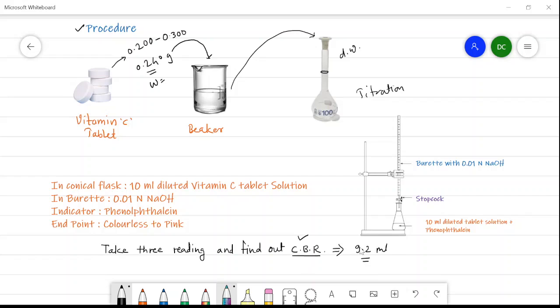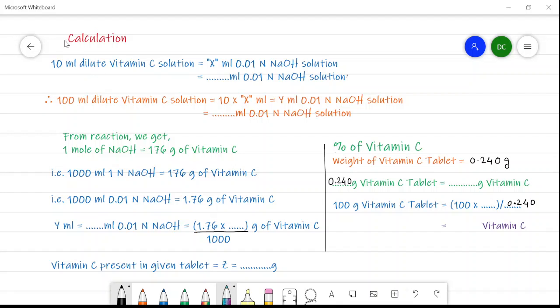The constant burette reading is 9.2 ml. Now we will see the calculation. When we take 10 ml of the dilute vitamin C solution we get a constant burette reading of 9.2 ml. So for 10 ml it is 9.2 ml, and for the whole 100 ml solution it is 10 × 9.2 = 92 ml.